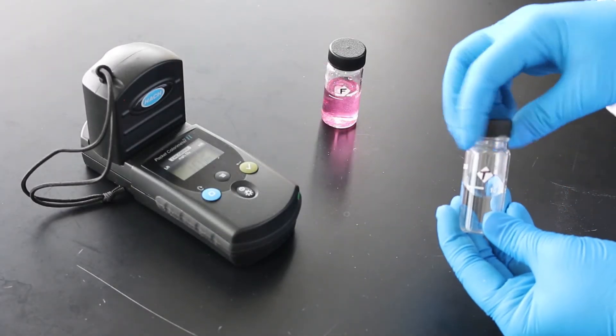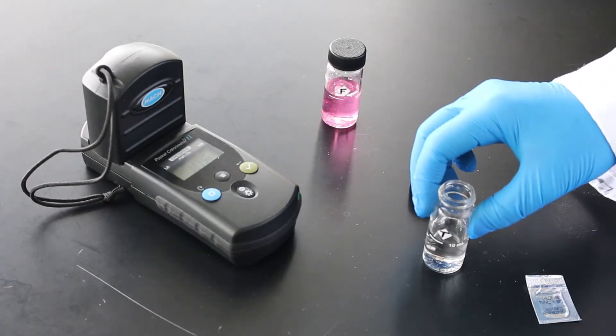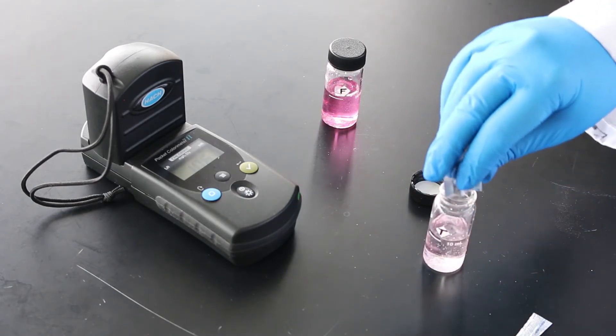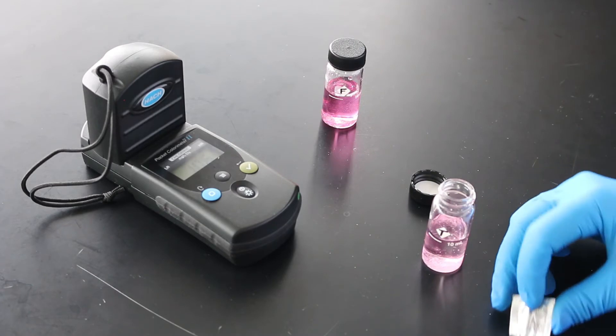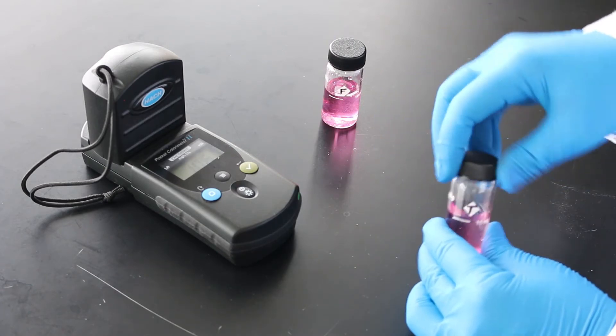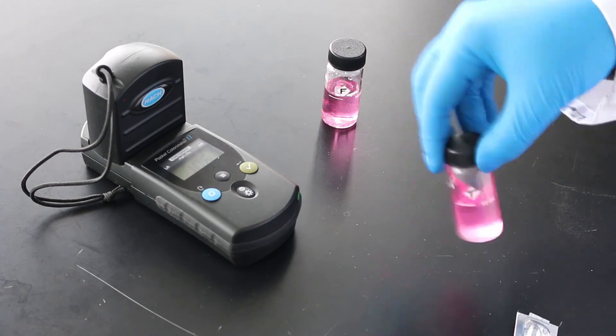It is important to note that if free and total chlorine are both being analyzed by an operator, different, dedicated cells should be used for each method. This is because trace DPD reagent can be carried over and will interfere with your residual chlorine readings.